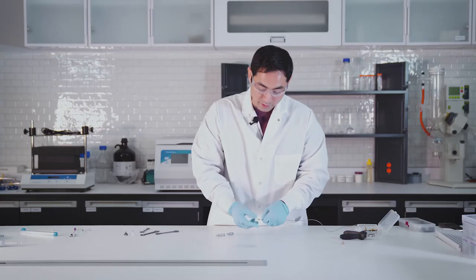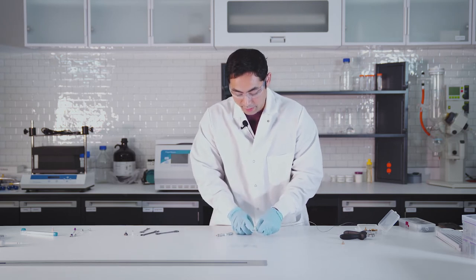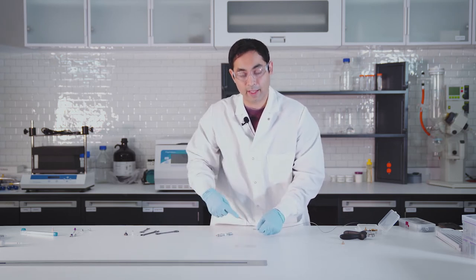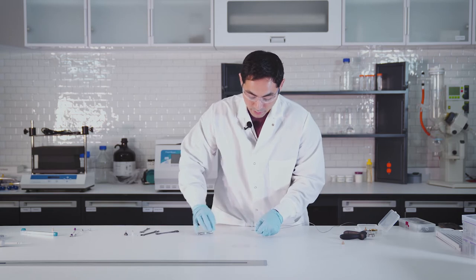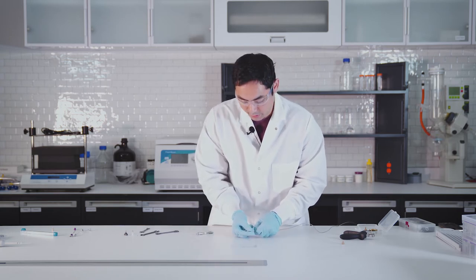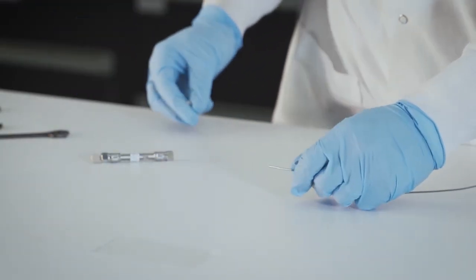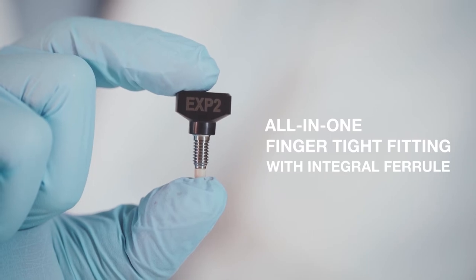The reason why these are really great though is because they work really well in a six port valve because the head is very small. So in a crowded area you can get a lot of them in one place and you can take it off once you're done. You see how this can just slide right off when you're finished, so it doesn't swage.